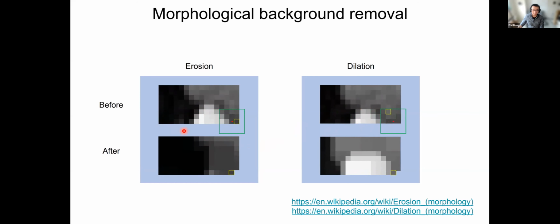The way we find the optimal shift is to look at the XY shift that corresponds to the maximum correlation value between these two images. And this is how we correct for motion for any pair of frames, basically doing this for consecutive frames over time. So that's quite simple. After motion correction, we end up with a movie that's clean of everything and also motion corrected.